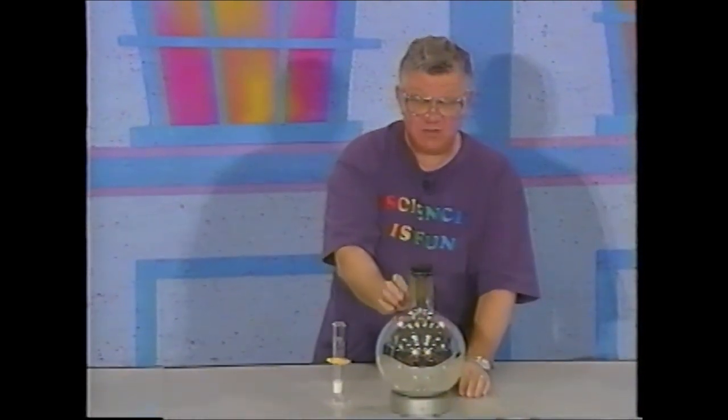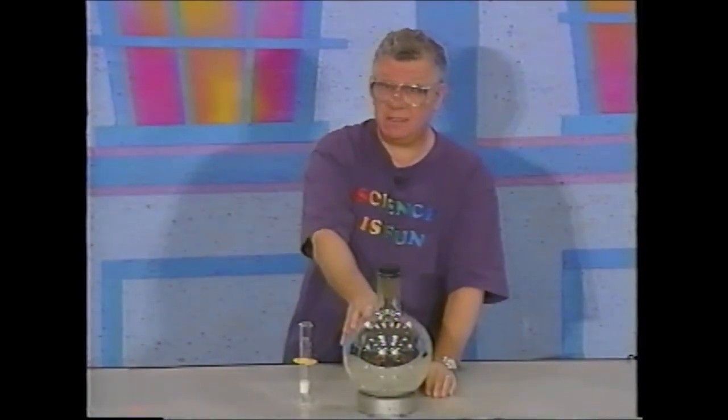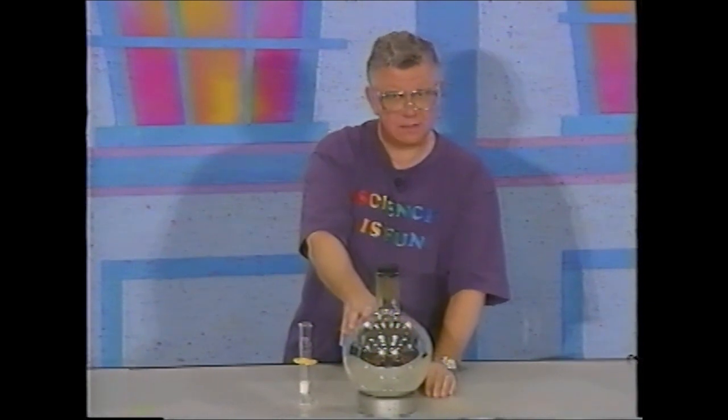There's a thin deposit of metallic silver that came out of the mixture that I used. In fact, this is how they used to make mirrors, and this is how they make holiday ornaments. So during the holiday season, if you go around town and see big ornaments like this, you know where they were made.